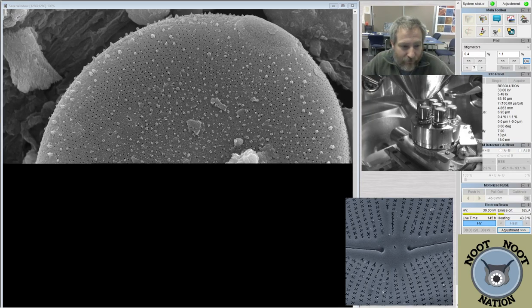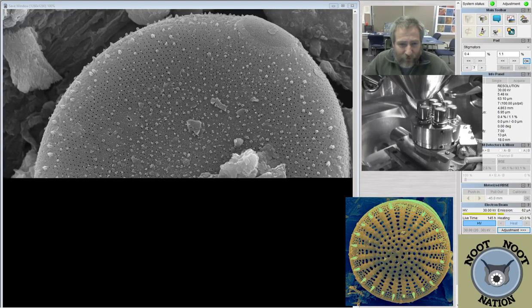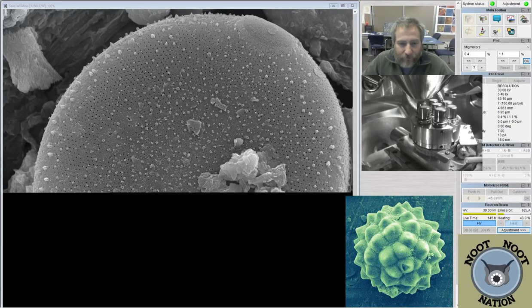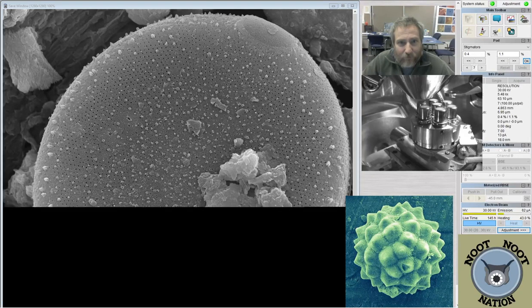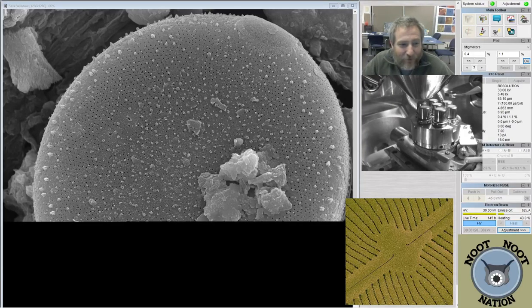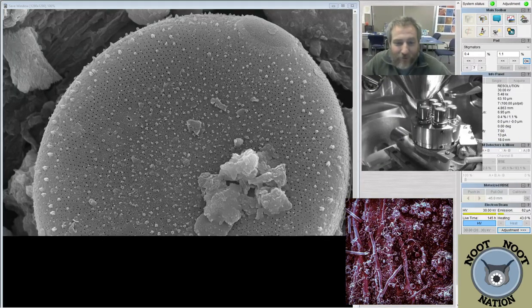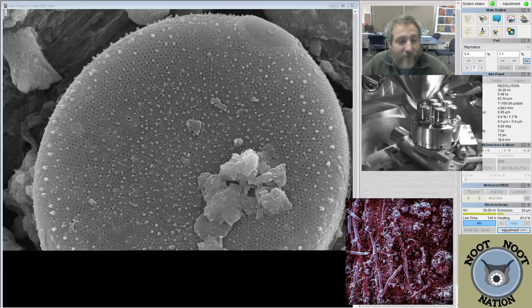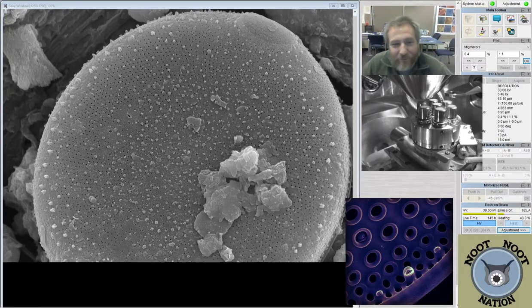I don't know what's common for a lake system in terms of the total number, or for a river system with respect to, okay, I've got 1,000 diatoms, how many different actual organisms are there here? But it's probably, in most cases, a dozen or fewer, and I don't know how to tell one from the other without some sort of genetic analysis. So we're at the point where when we're looking at clones, we don't know which ones are which. So it creates an issue for giving things names. I tend to think of them as all the same organism, because probably they are in many cases. We don't have a good boundary for naming clones separately, I guess.